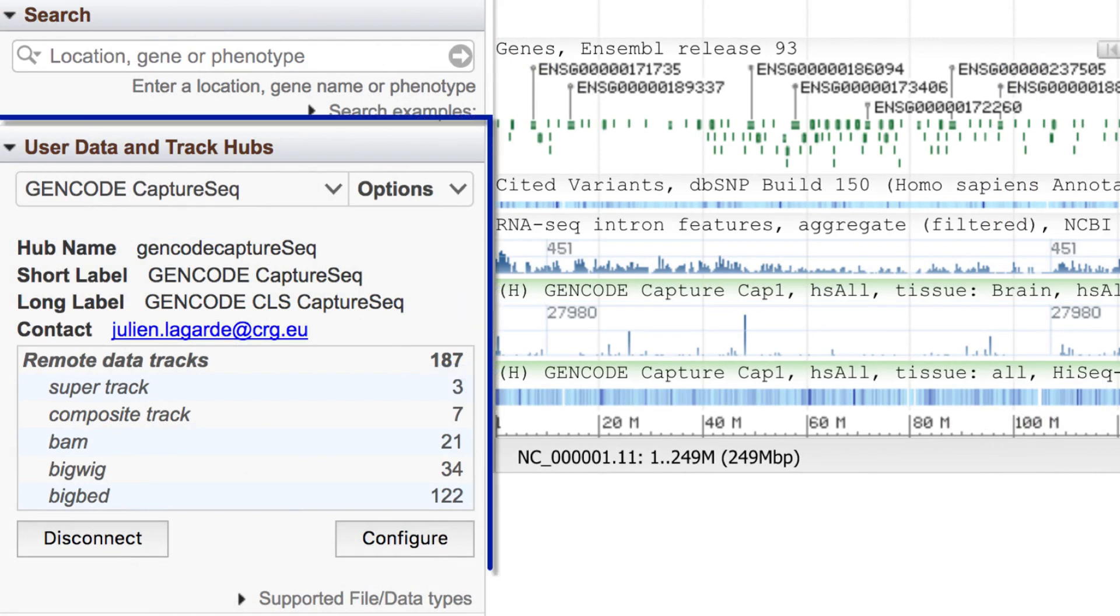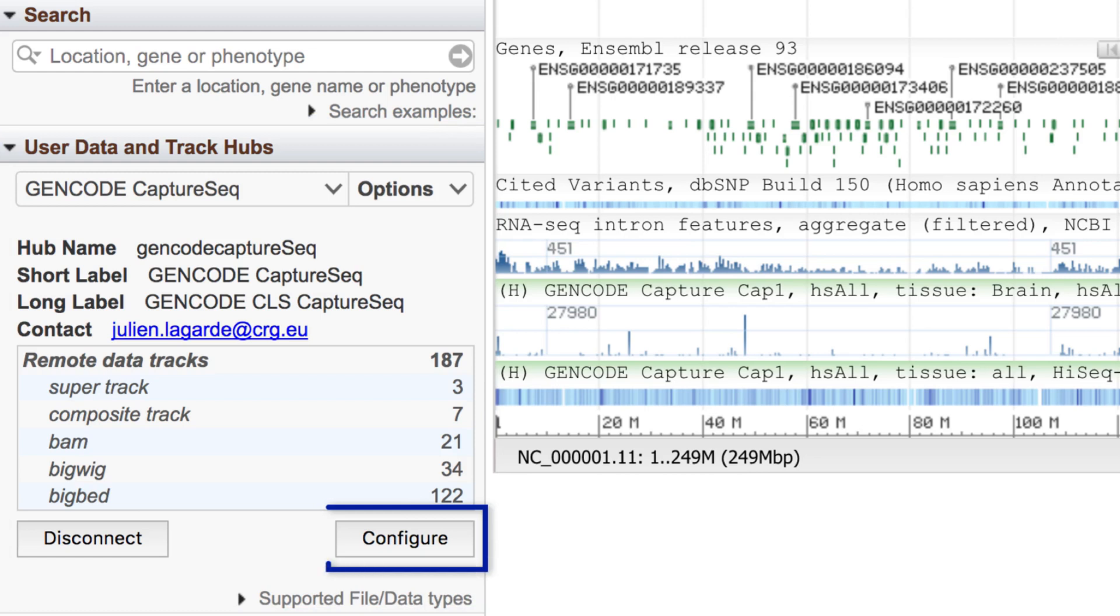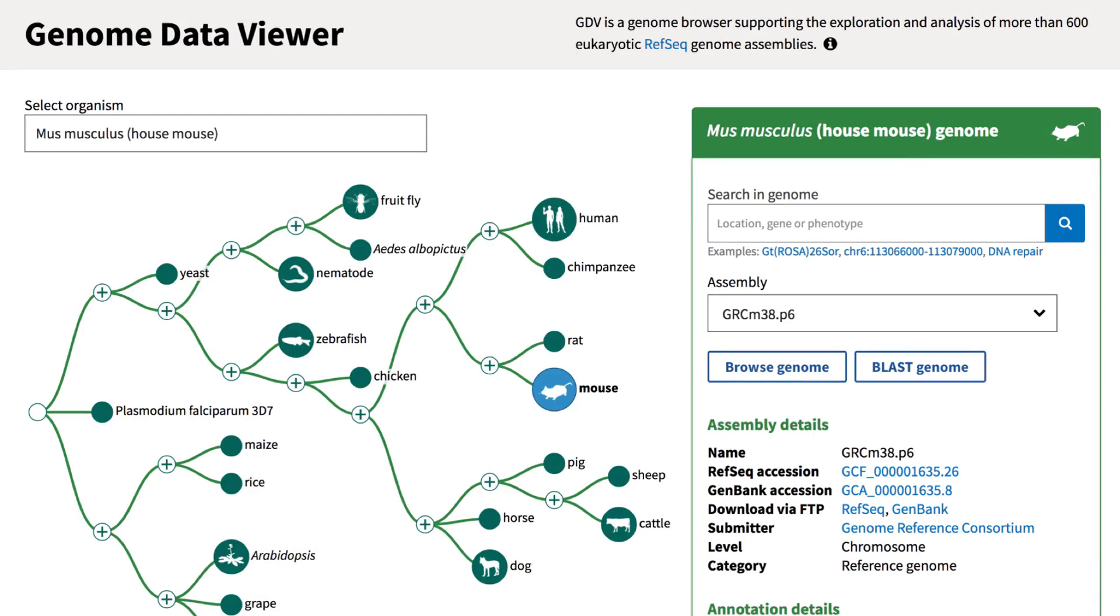The widget offers a summary of the tracks, and you can return to Configure to refine your choices or explore the same hub in another organism, such as mouse.